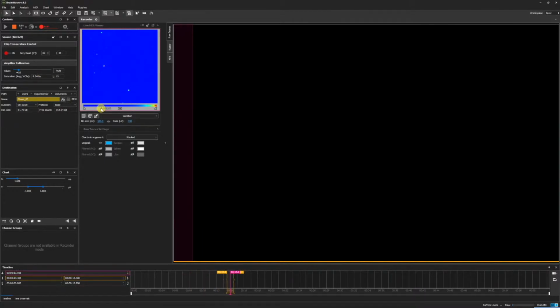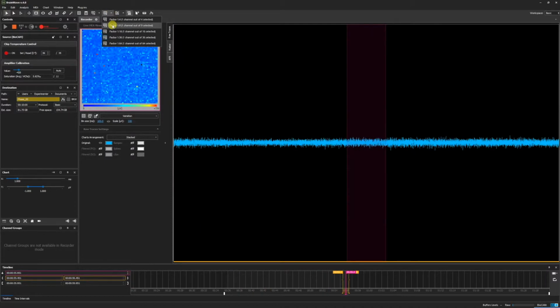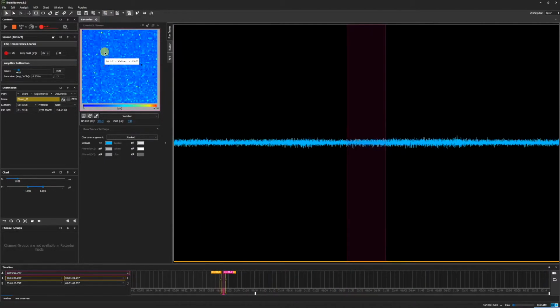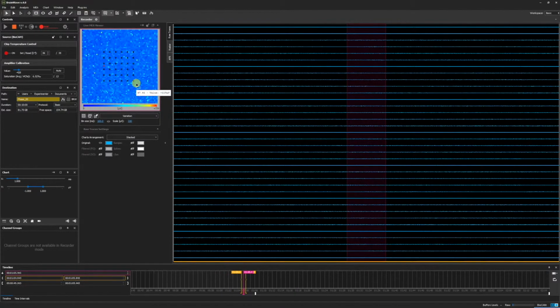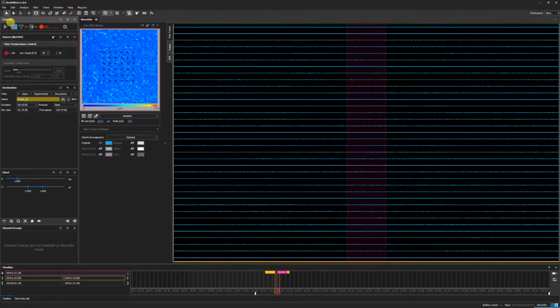The color threshold on the MEA viewer may also be adjusted to allow for better visualization of your acquired data. Use the grid selection tool to take a small sampling of the microelectrodes to make sure that everything is calibrated correctly. Now that the biocam settings have been optimized, we can pause the data acquisition in real time by clicking Stop under the Controls panel.